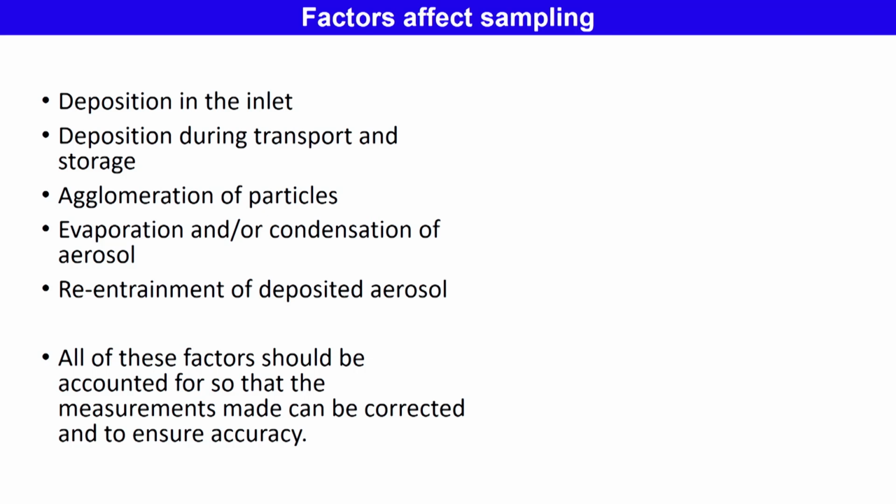If there is more evaporation of the particles or condensation of aerosols, this can also affect our sampling. Re-entrainment of the deposited aerosols can also affect it. All of these factors should be accounted for so that the measurement can be corrected and accuracy ensured.